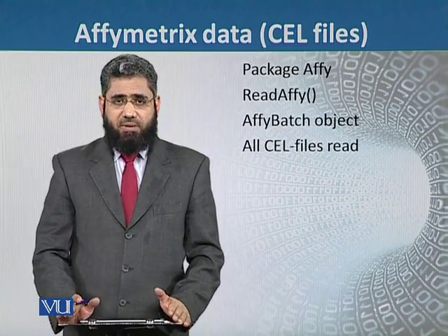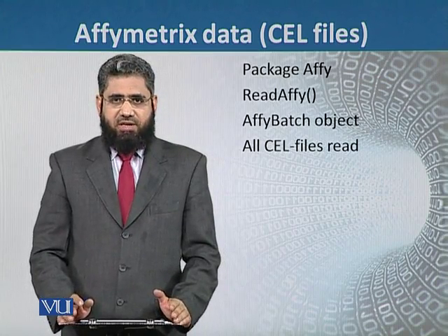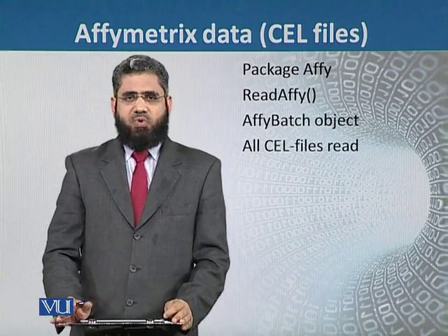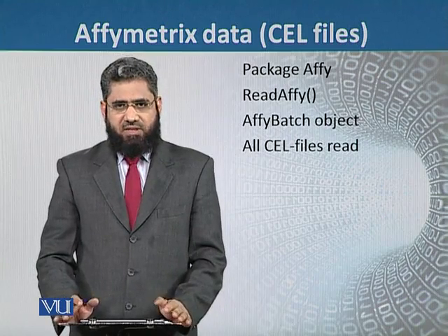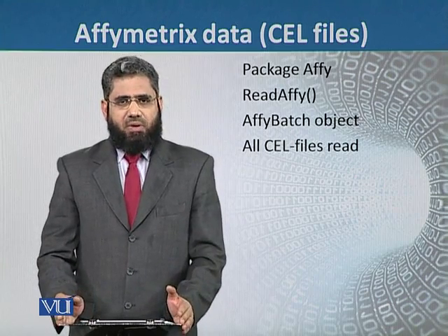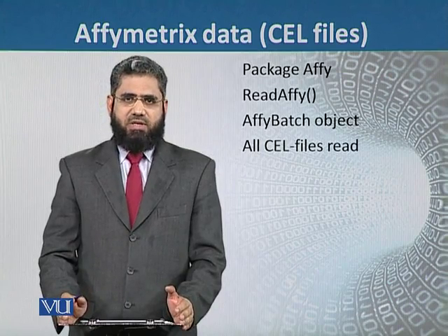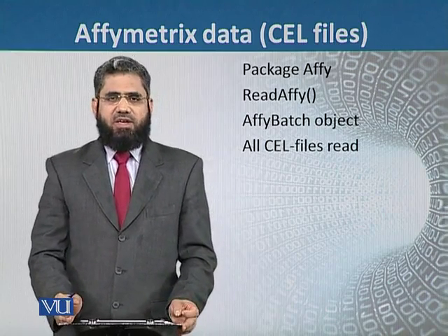In short, they are hybridized with the sample of cDNA, and they will bind complementarily with the sample of cDNA. Every gene has different probes, and specific probes will bind with specific cDNA. These cDNAs are then visualized in specific scanners, and the expression data is analyzed by using the color of the cyanine dyes.